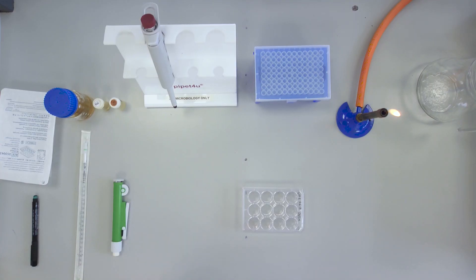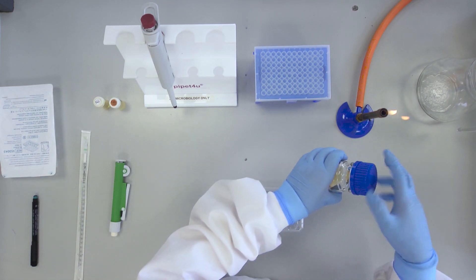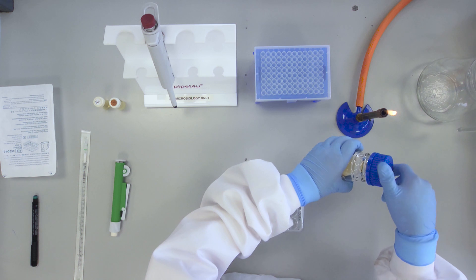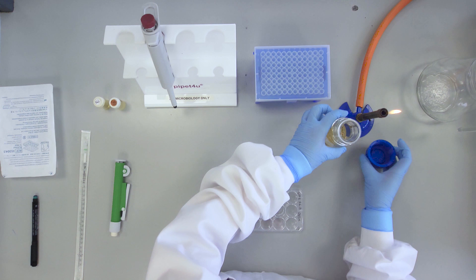Using aseptic technique, add 2ml of sterile tryptone soya broth to each of the 12 wells using a sterile 2ml plastic pipette. Take care.